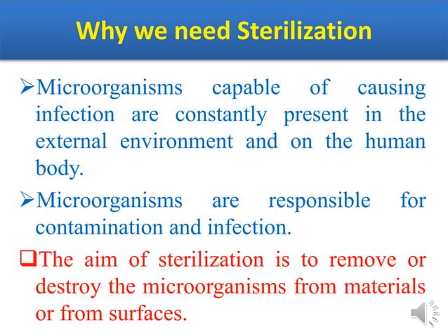Then we have to go for the sterilization process. The main aim of sterilization is to remove and destroy the organisms from the material or from the surfaces, leaving them completely devoid of organisms, especially in life-saving equipment or life-saving areas. In all these areas, the organisms should be removed, especially in hospitals, surgicals, ointments, food, beverages. Even in households, we have to remove the spore forming organisms. So for this procedure, we are in need of sterilization.